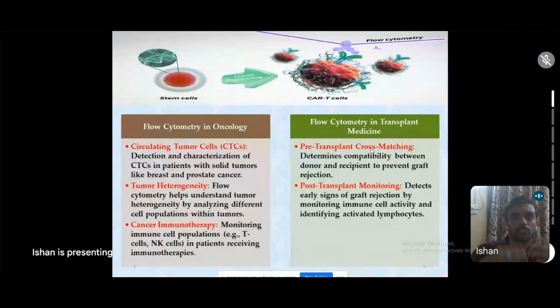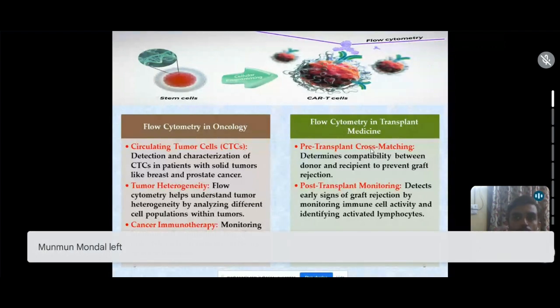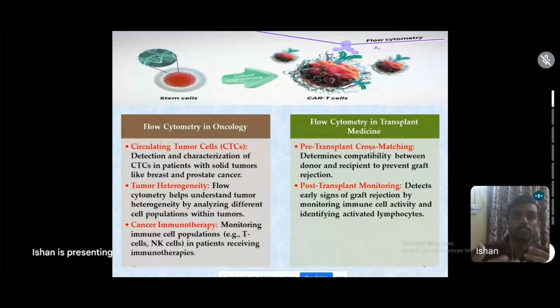Not even just the cells, we can have circulating tumor DNAs and circulating tumor RNAs. Small molecules or particles can also be detected, which can give us an analysis, or advance information about whether our body is prone towards tumor or cancer in later stages of life. So that can be a good prediction for our susceptibility towards a particular disease.